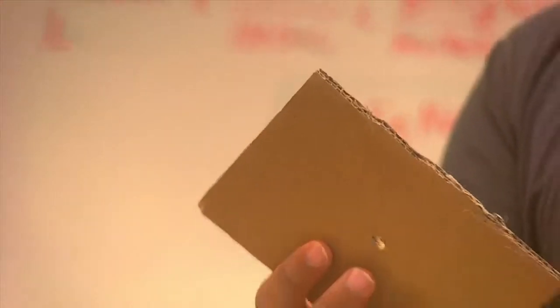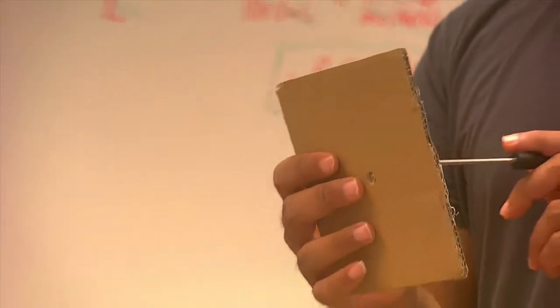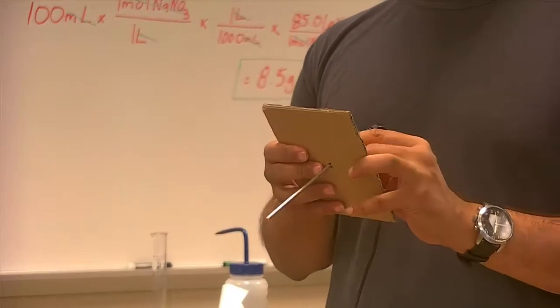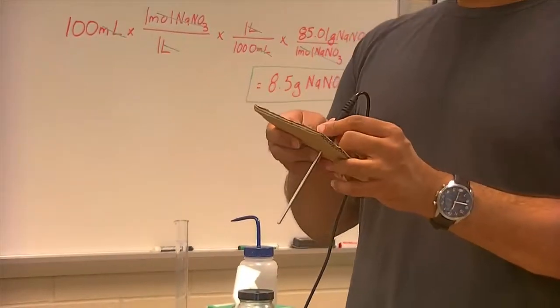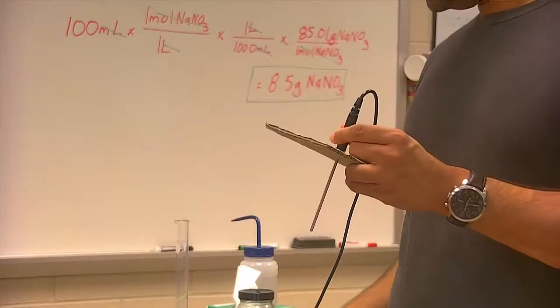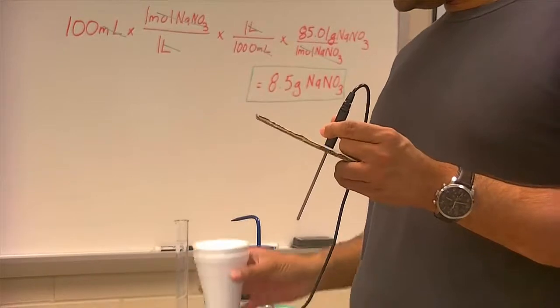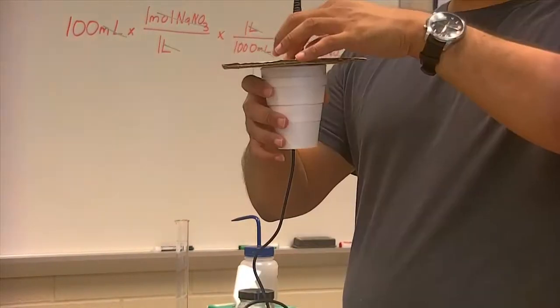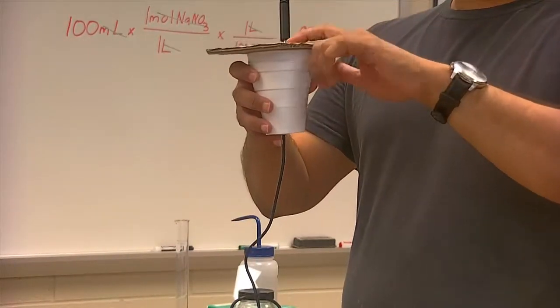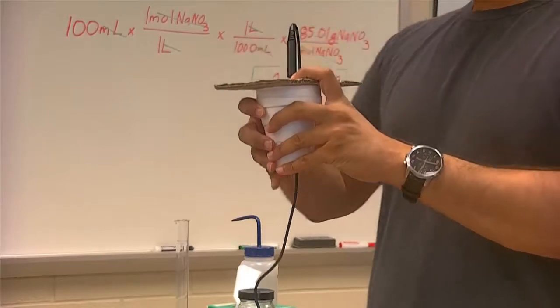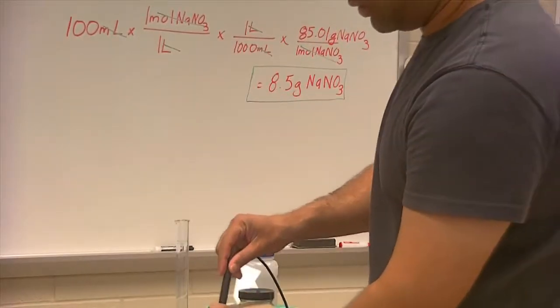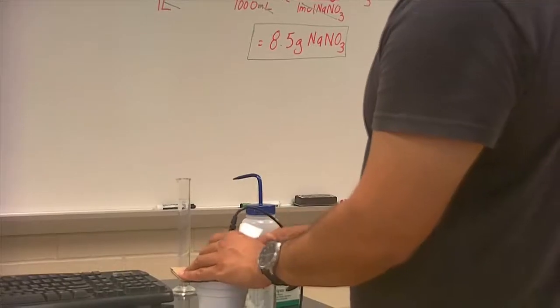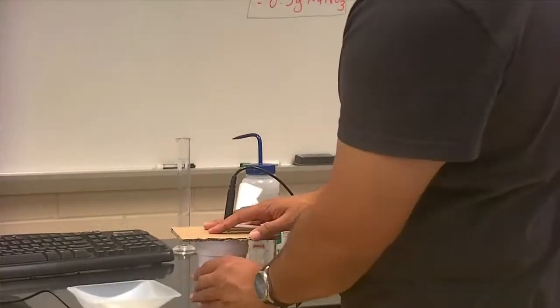We have our temperature probe and our little cardboard square that will serve as your lid. Before I add anything, I'm just going to put the probe through the lid — that is going to be my calorimeter. You may want to get your partner to help hold this straight; leave it on the bench.